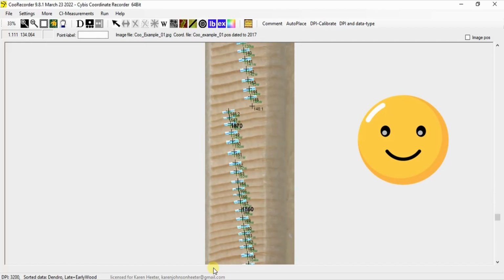So we solved this problem by adjusting the frame width, but note that this is not the only solution. I could also go back and shift my original ring boundary points to be further away from the edge of the core. I could also try adjusting the frame width limiting factor. Importantly, we would like you to know that there is never a one-size-fits-all solution. Rather, we recommend using a combination of strategies when quality checking your data.